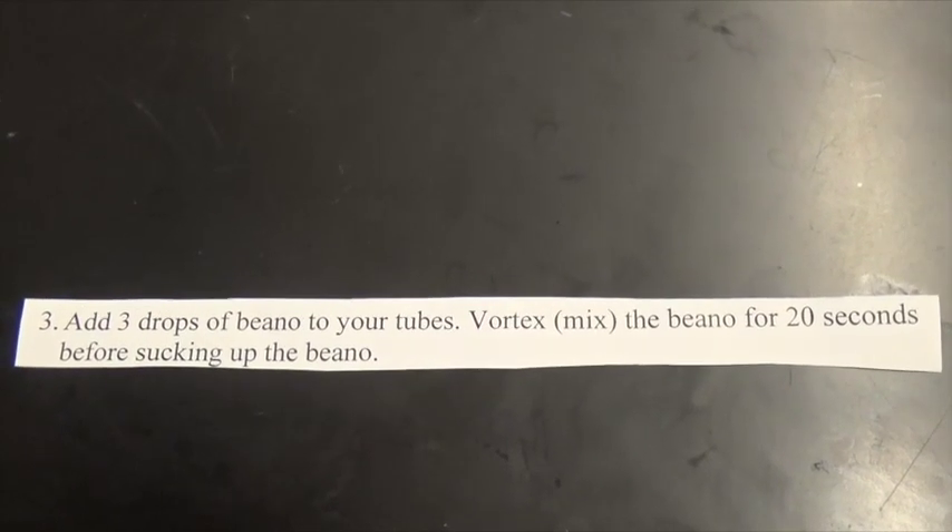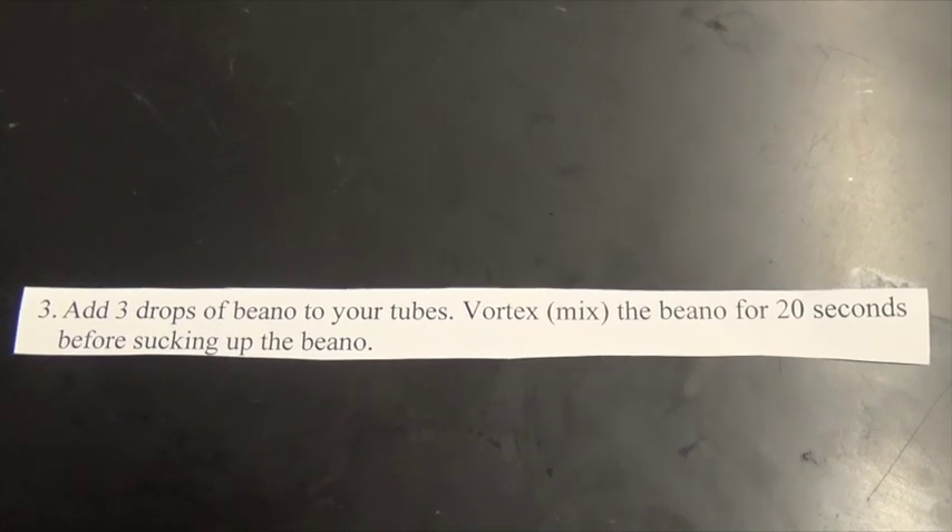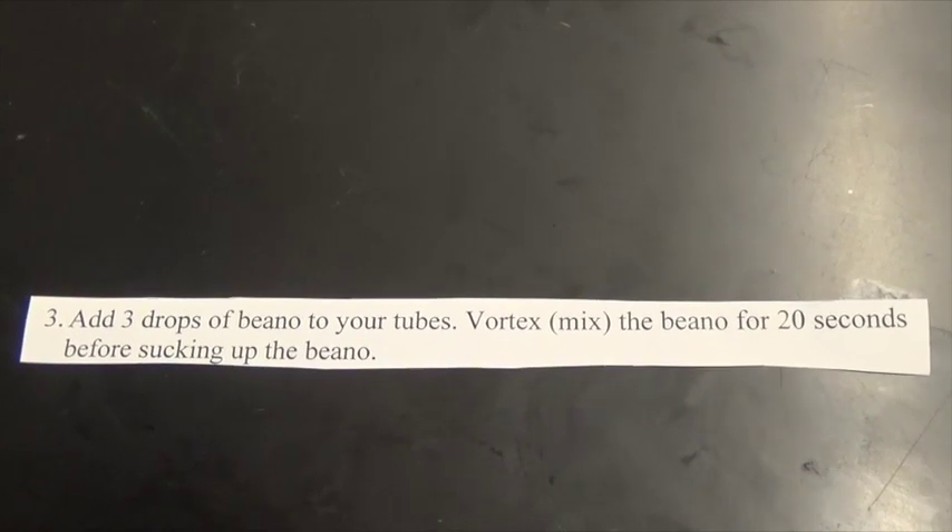Number three. Add three drops of Beano to your tubes. Vortex the Beano for 20 seconds before sucking up the Beano.